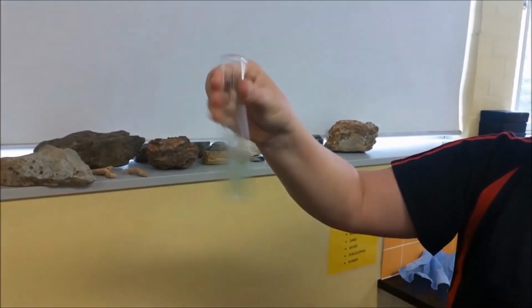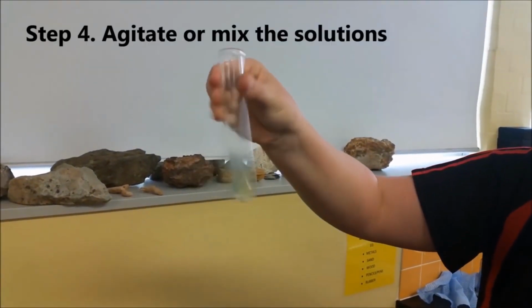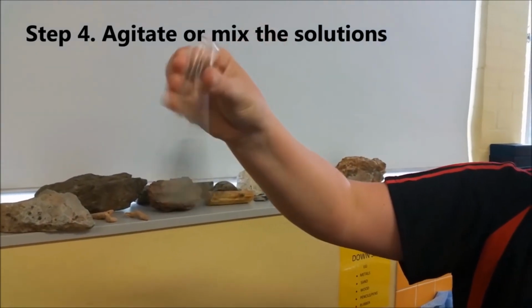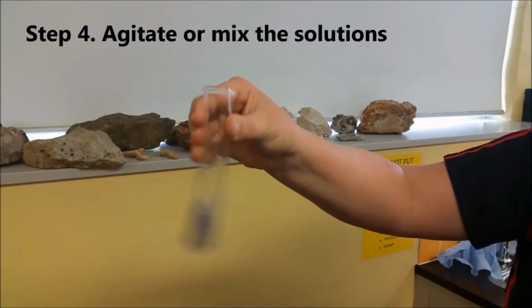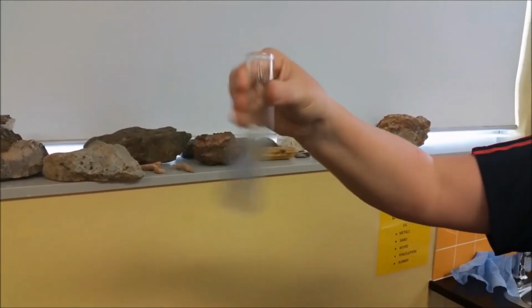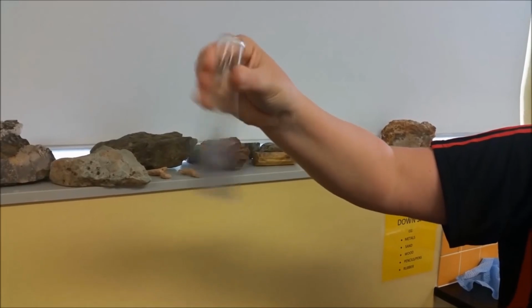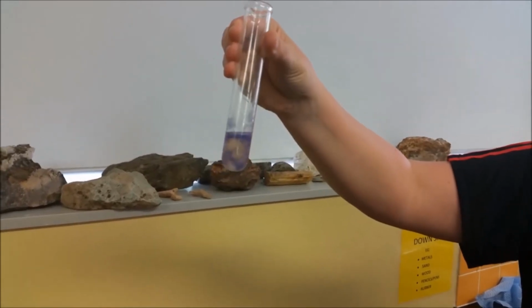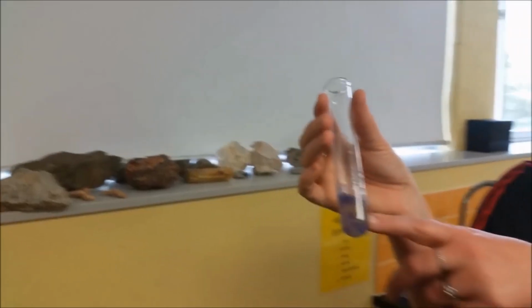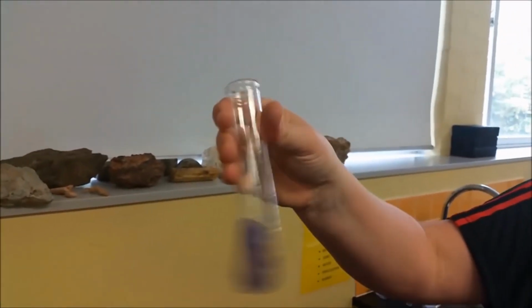I'll do a little bit more because I've got quite a lot of the copper sulfate, and then give it a mix. Can everyone see the colour change that's occurring? Yeah. All right, what colour has it gone? Purple. Now that protein solution is quite thick, so it's not mixing evenly, but it is mixing.